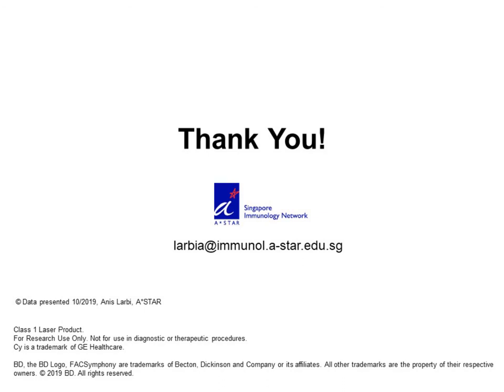Yes, very good question, as this is very important to clean the signal we are detecting. Very often we work with either cryopreserved samples or samples that need some treatment, in the case of tissue dissociation. So you clearly need a viability dye to exclude your dead cells from the signal you analyze.